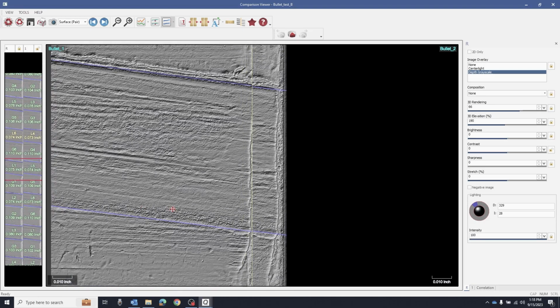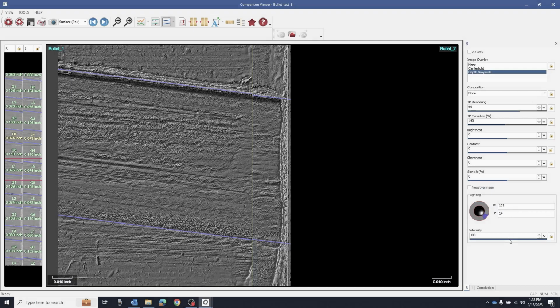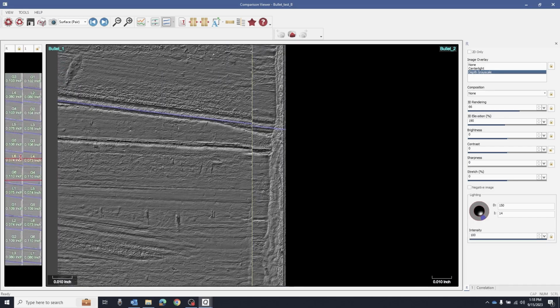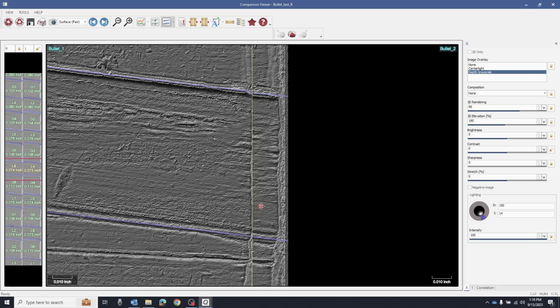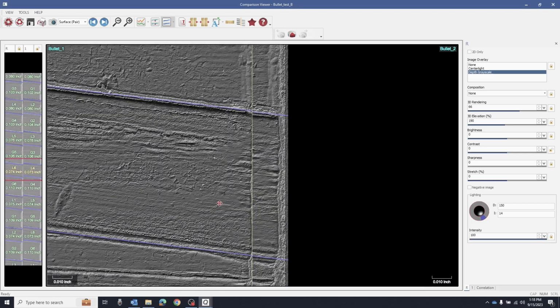One to 5. And then that takes us all the way around back to where we started, 6 to 4 once again, which 6 to 4 and I believe 5 to 3 were probably the two most well marked within this set.